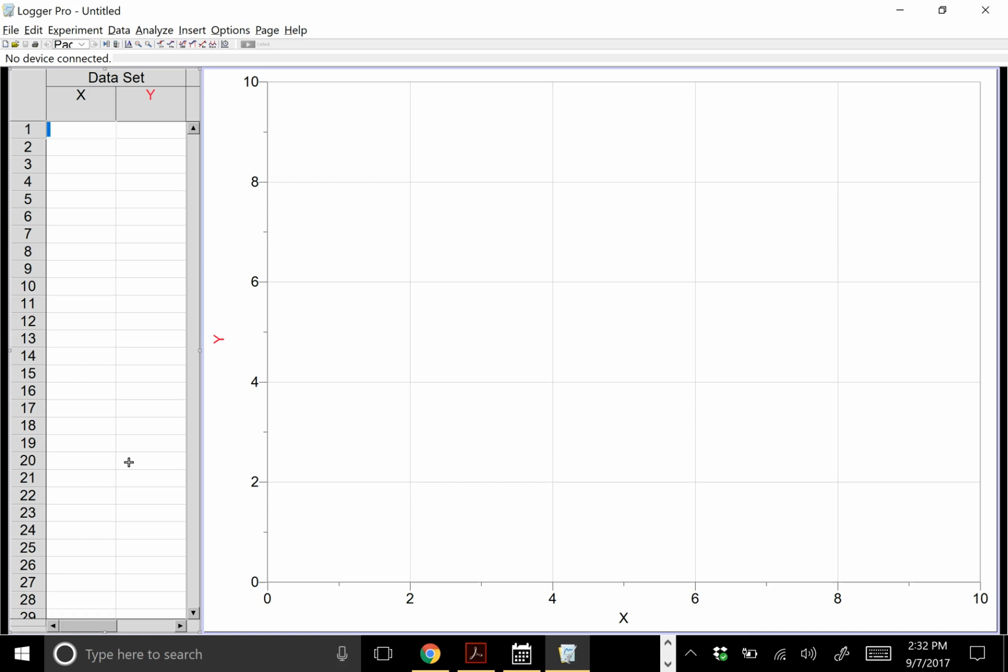In General Chemistry 1 and also General Chemistry 2, you're going to have to get Logger Pro under your belt, so you might as well get it there now. I'm going to focus on the sugar lab that some of you are just now creating or completing, and we're going to put in the data that I already talked about before.